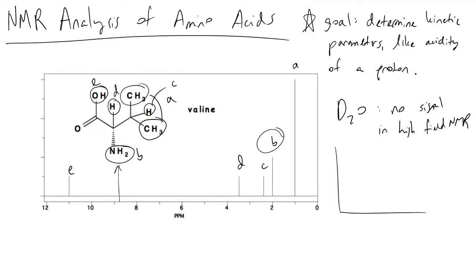So if you had some deuterium atom come in here and swap out with this amine, what will happen is this signal intensity, as we'll recall, the peak area on our NMR spectra is proportional to the number of protons that are present. And so if we're taking off protons and substituting them with deuterium, the area will decrease over time.